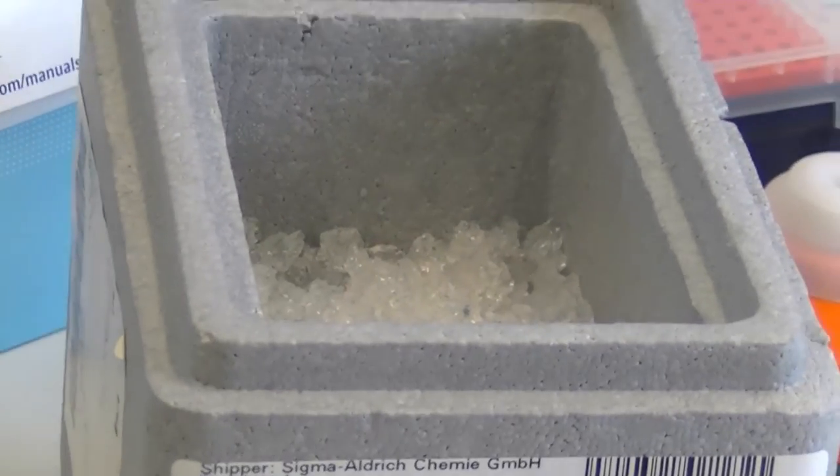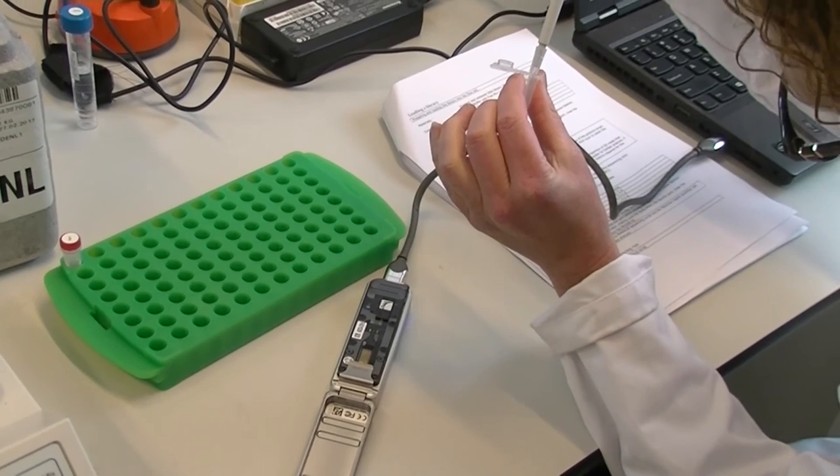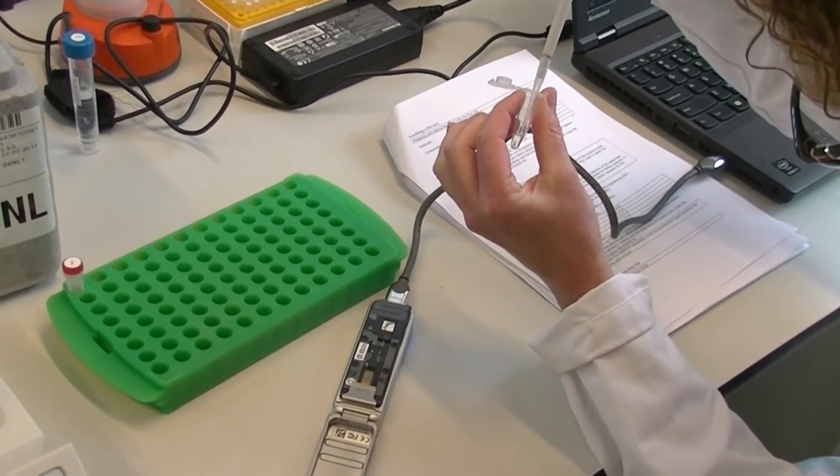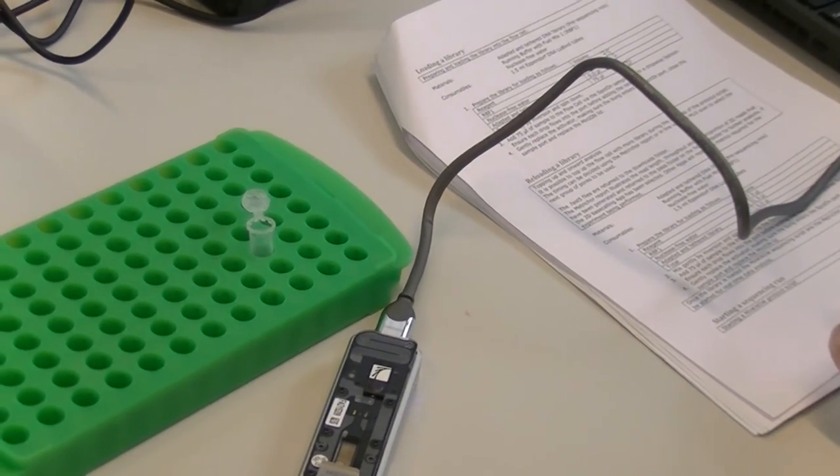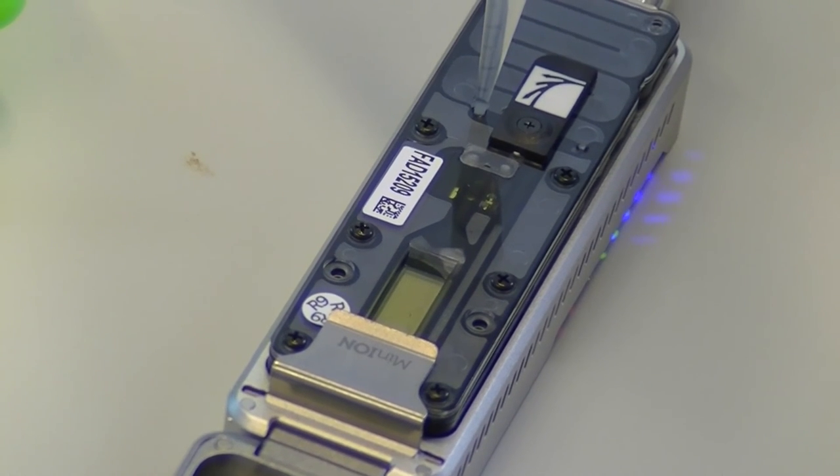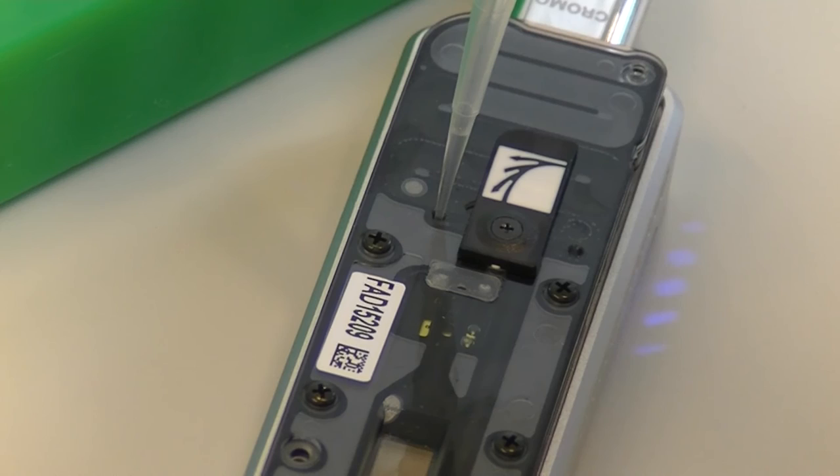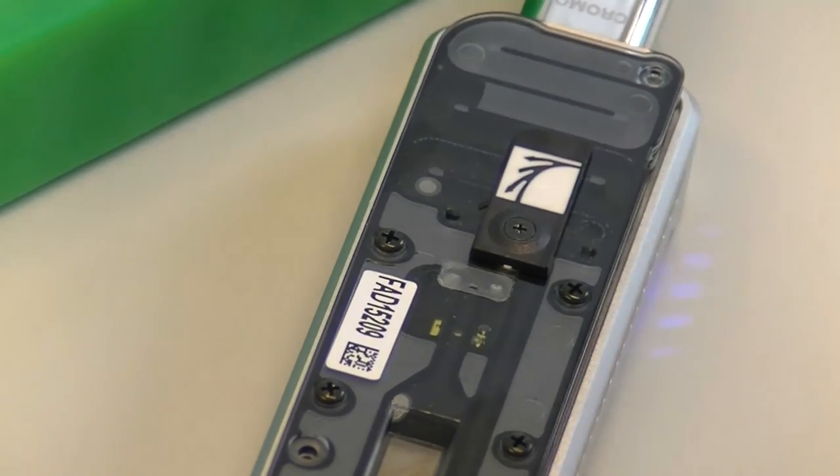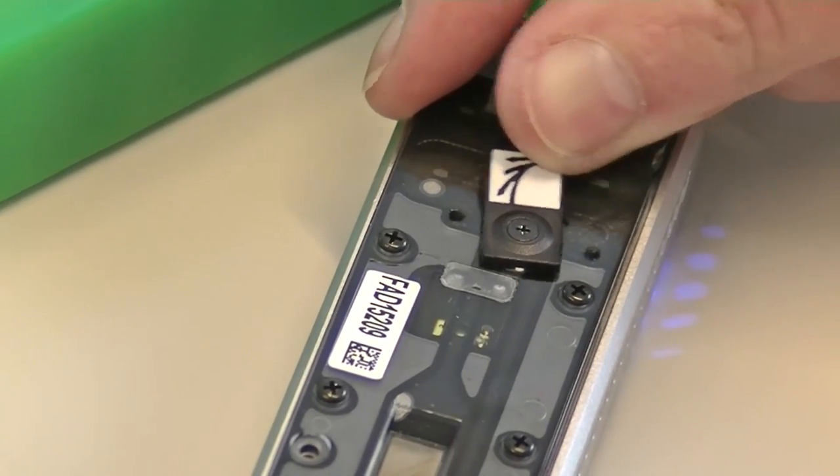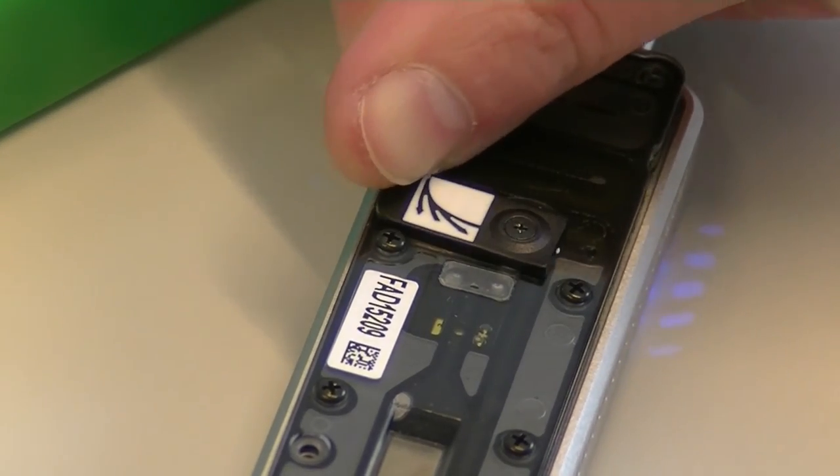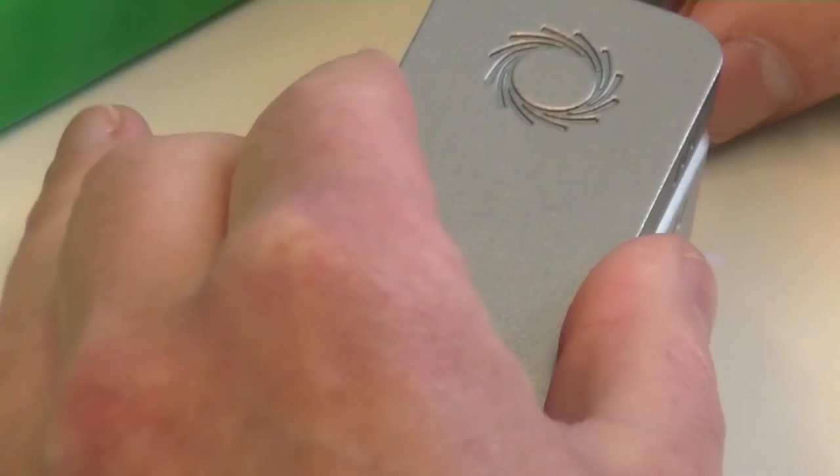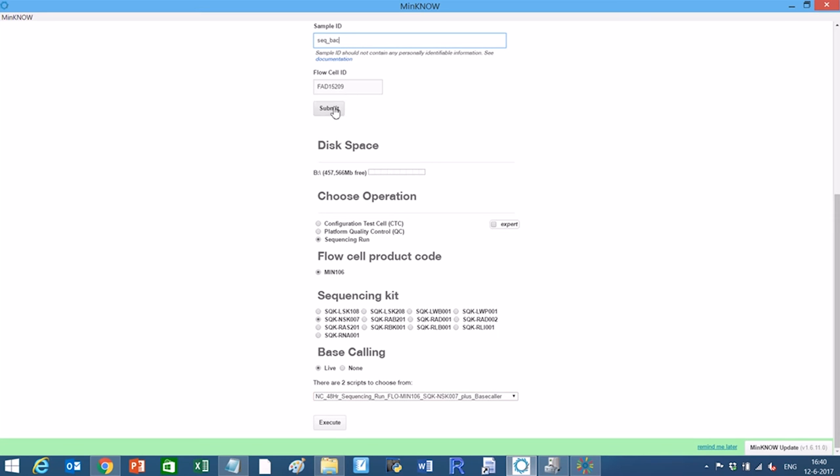Store the pre-sequencing mix in an ice bucket. Now, the DNA library has been loaded to the MinION. Start a sequencing run.